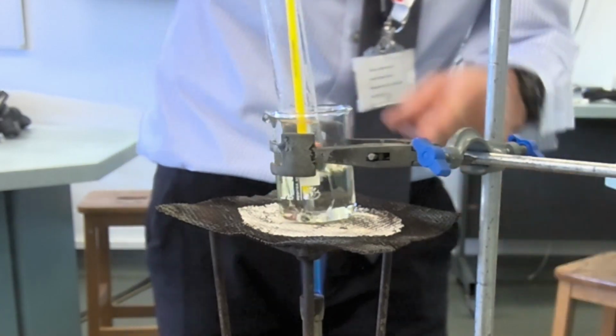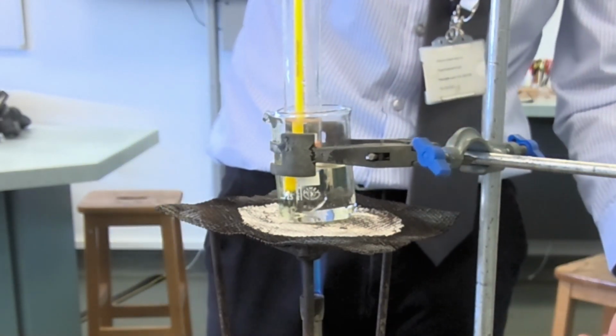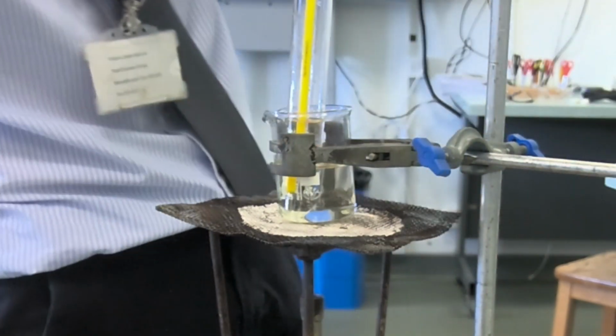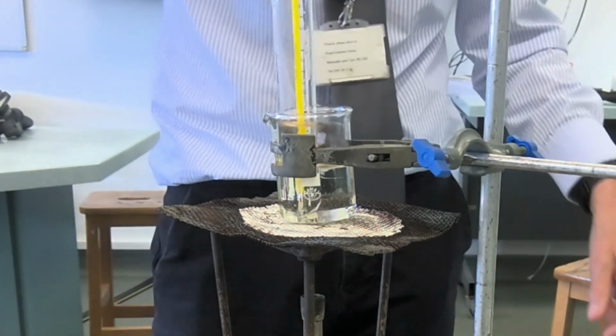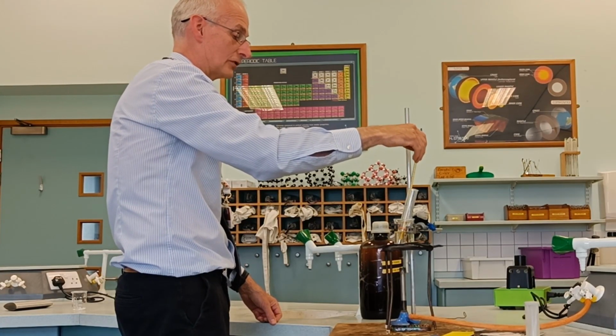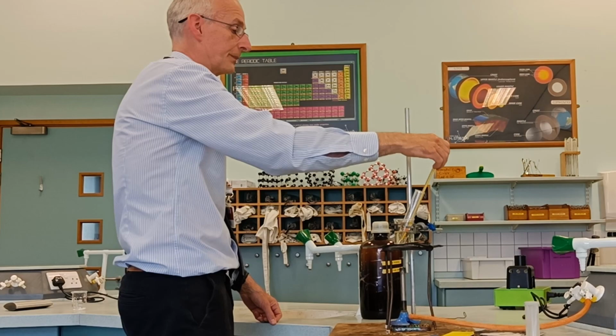I'm also getting, I don't know if you can see, because we're starting to get bubbles in the glycerol. Okay, so that's a bad thing. So I'm going to turn this off now. Okay. And just let the residual heat take it up there. I'm just looking through and seeing where it goes.